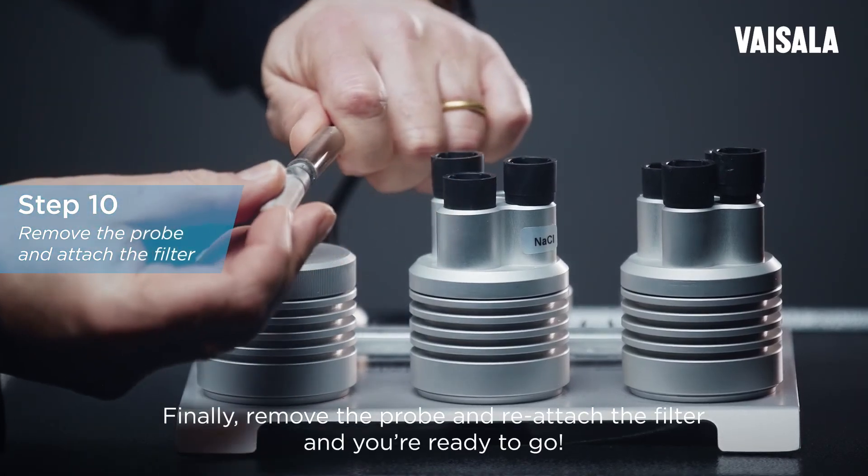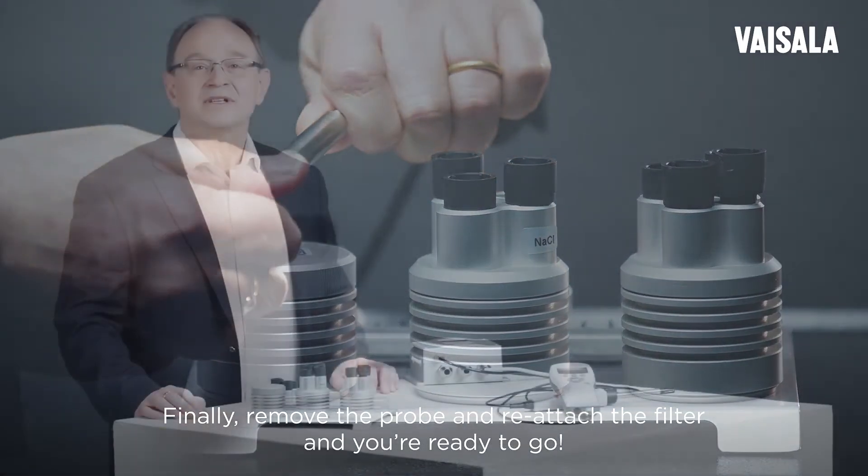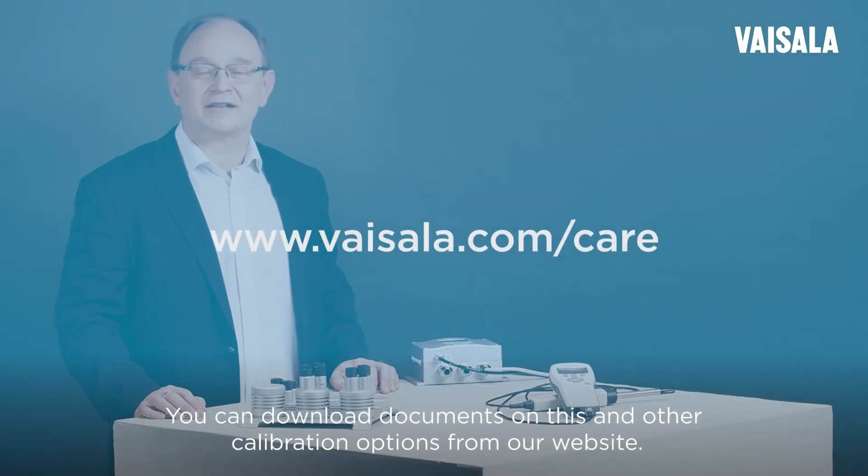Remove the probe and reattach the filter and you're ready to go. You can download documents on this and other calibration options from our website.